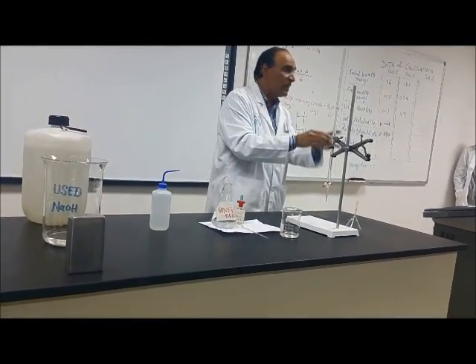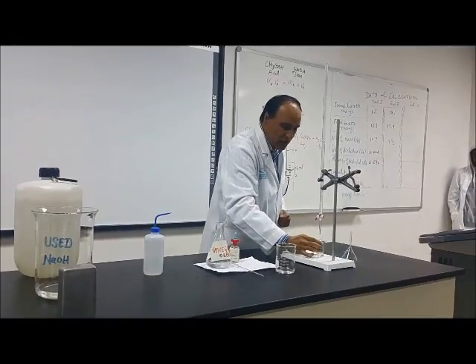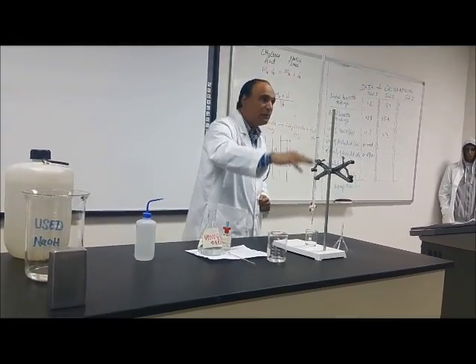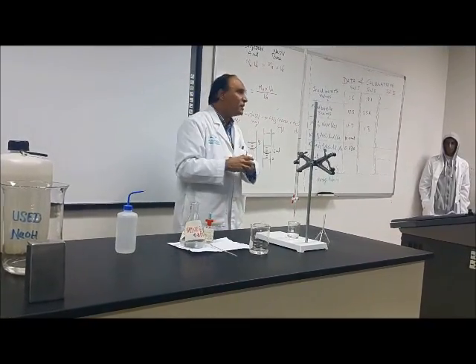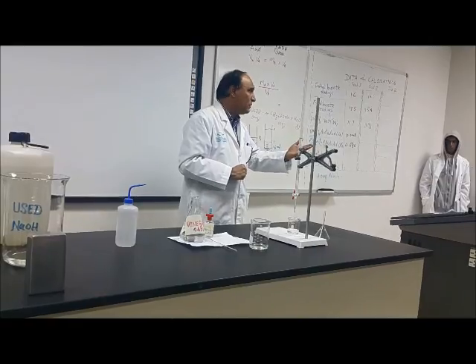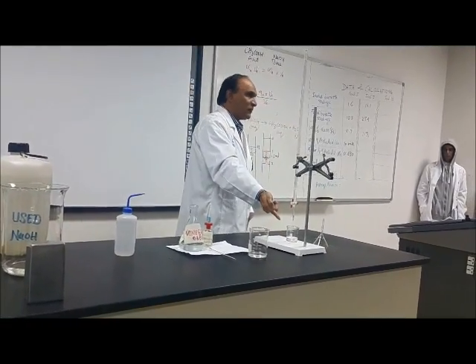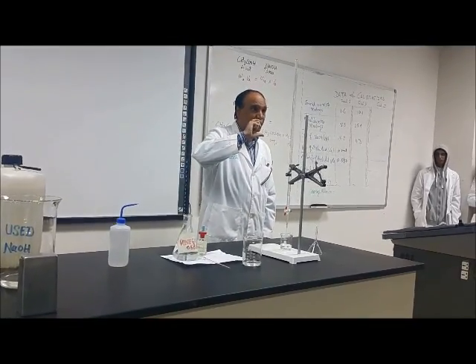And what is over here? Hydroxide. Sodium hydroxide. You take the sodium hydroxide back. Return it back. And as I told you, whatever quantity I am giving you, you will not use even half. That quantity is more than enough.